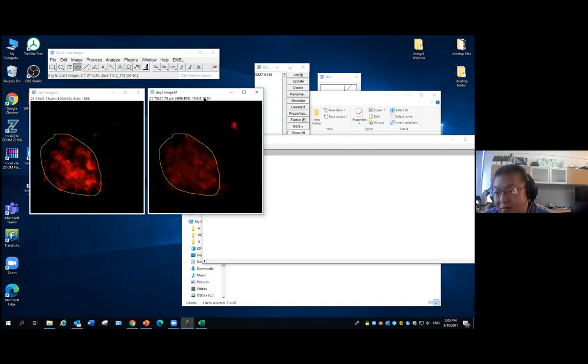Okay? And many times I want you to make sure that when you take the images, you take them under the same condition. We do see it happen in real life that people have two images and somehow, between day one and day two, something changes. Maybe another user goes to the system and sets a preference on the camera to 16 bits rather than 12 bits before. And maybe in the laser scanning confocal, they change from 8-bit to 16-bit. So when you take the picture, you need to know your pictures are the same.